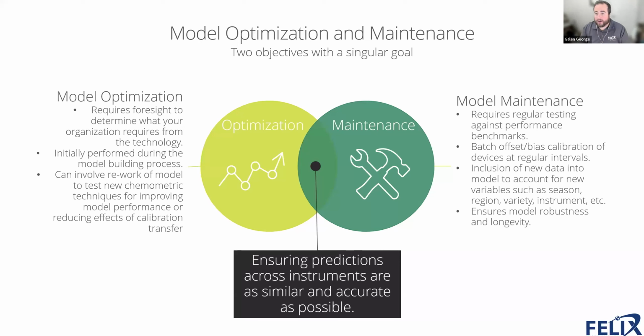Once you're on a regular maintenance schedule and you're actively aware of this technology and what it requires, then these kinds of processes can be built into your organization and your normal routines. And so it just becomes another part of all the other technology that you're utilizing in your organization. Once you get to this point, it's not as much work to maintain the model. It's just a little bit of effort every year to make sure that this instrument is going to keep working for you as best as possible.